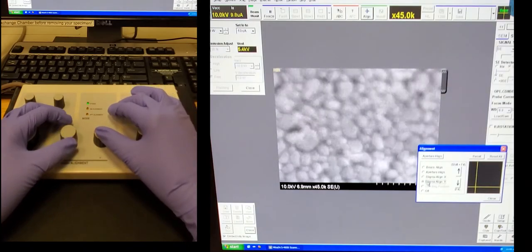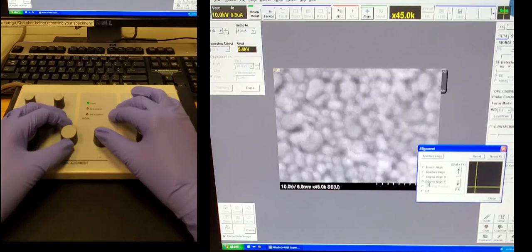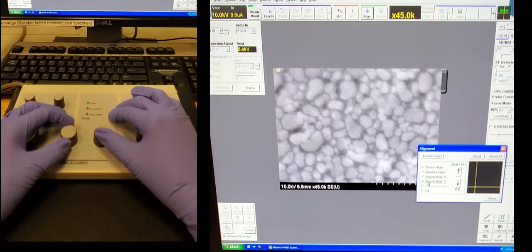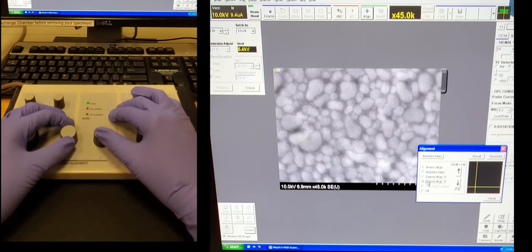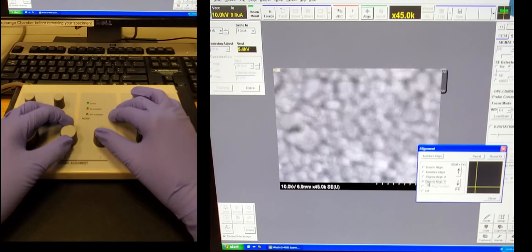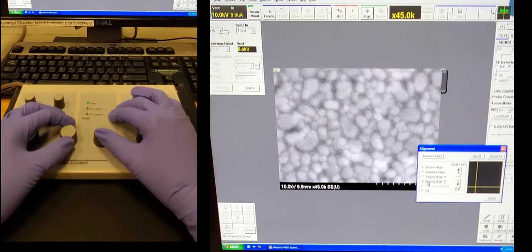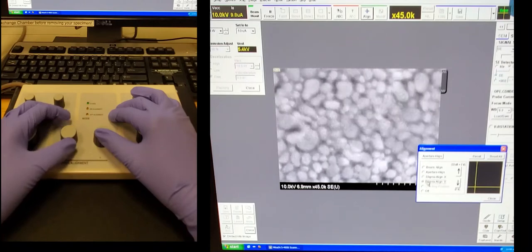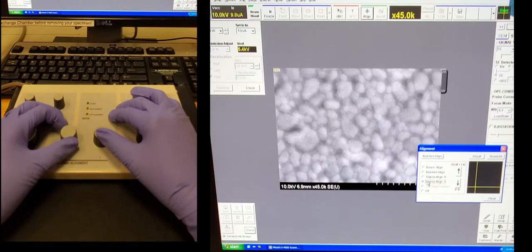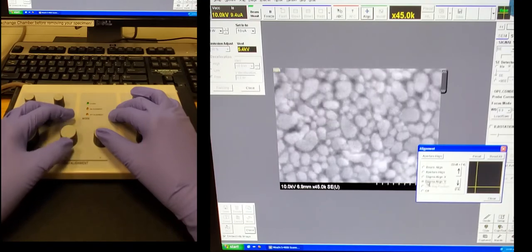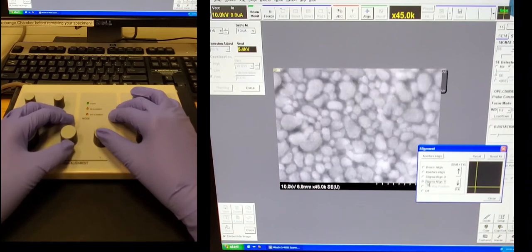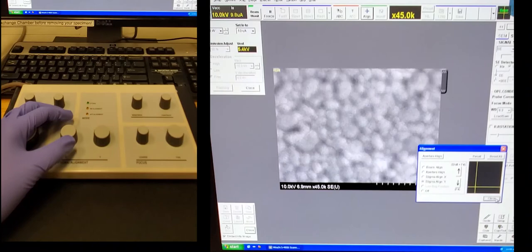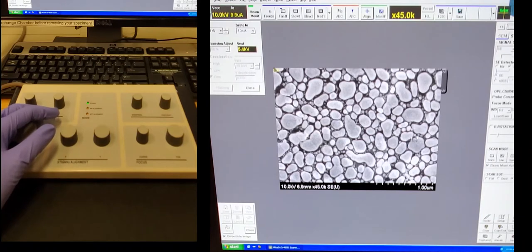You can see it's getting worse, so I'm going to go back. So this is probably the best kind of position for this. We'll move to the last one. It looks like there's a lot more image wobble in the x direction, so we'll use the x knob first.